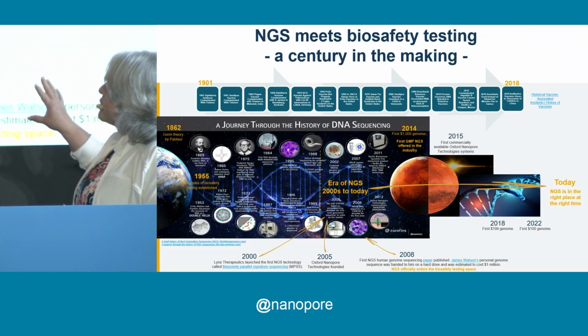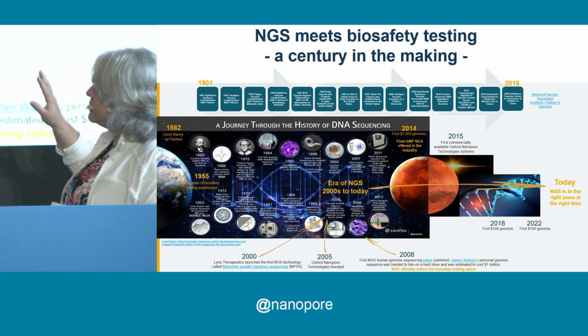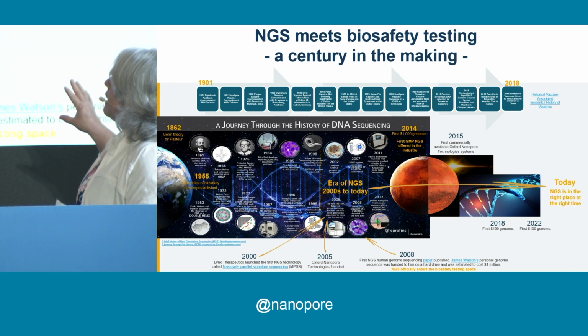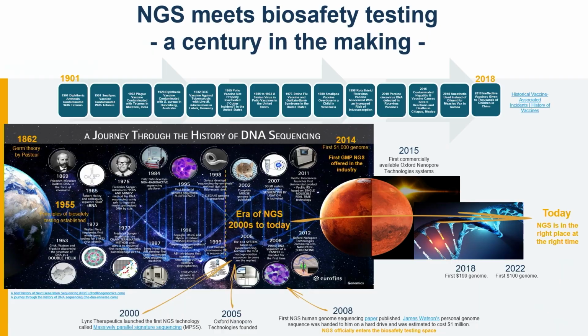So I just wanted to give a little bit of a crash course here of the merging of a few different areas, or of a historical timeline, and how it's really important in this space, including the tools that we use. So this is one of my favorite slides. If you think about it, this is a long history of things going on in the world with not only sequencing, the emergence of DNA, understanding of DNA, overlaying that, pharmaceutical production, biosafety testing, and so forth, and just trying to keep pace with things.